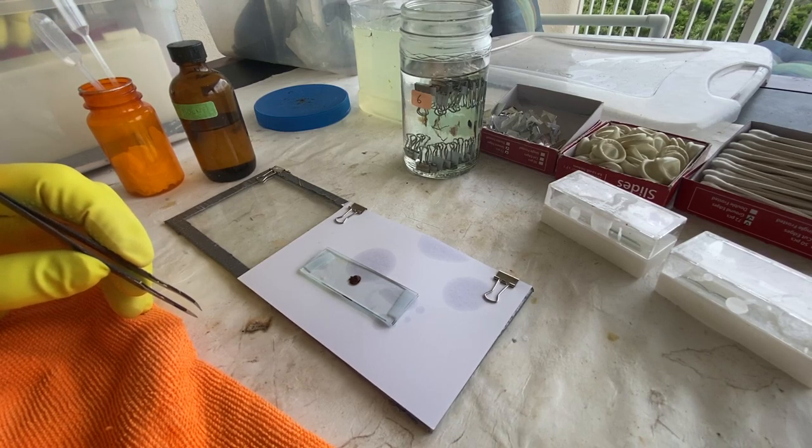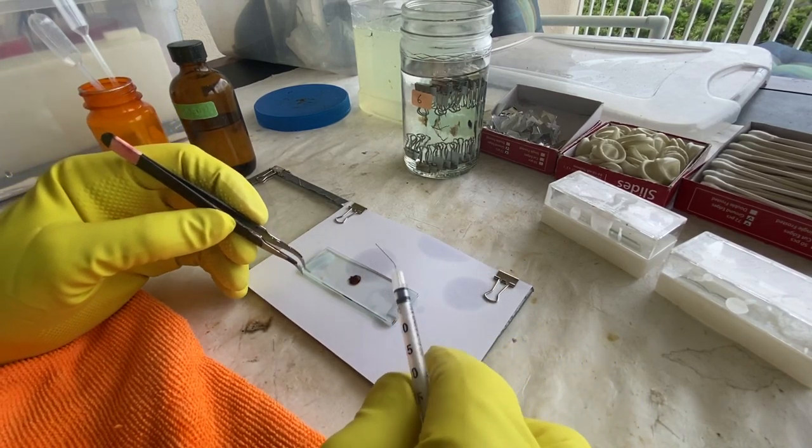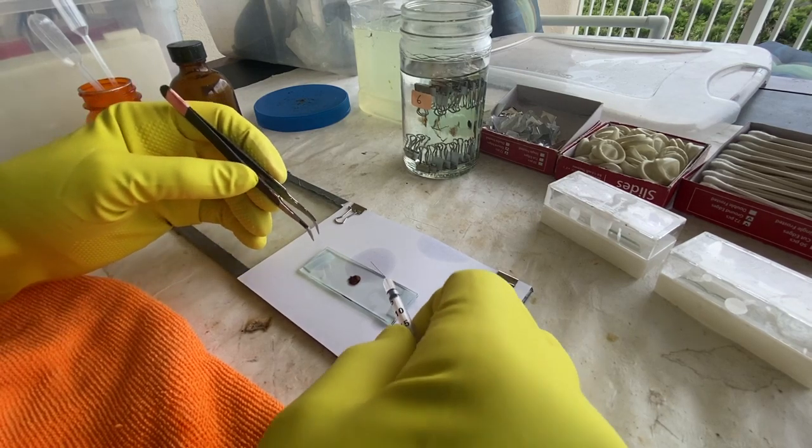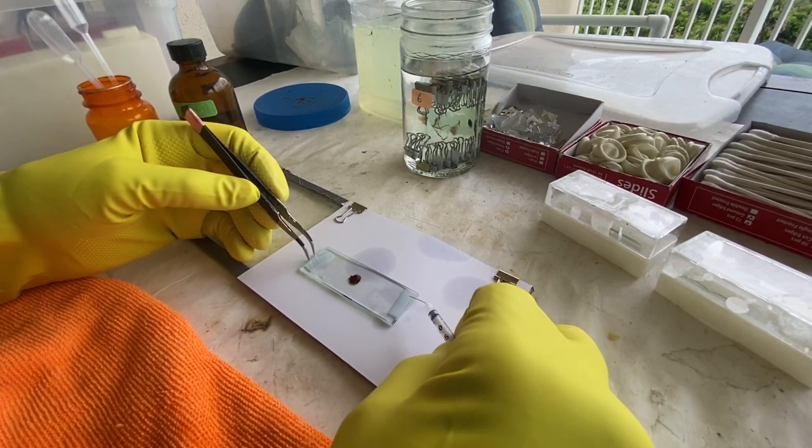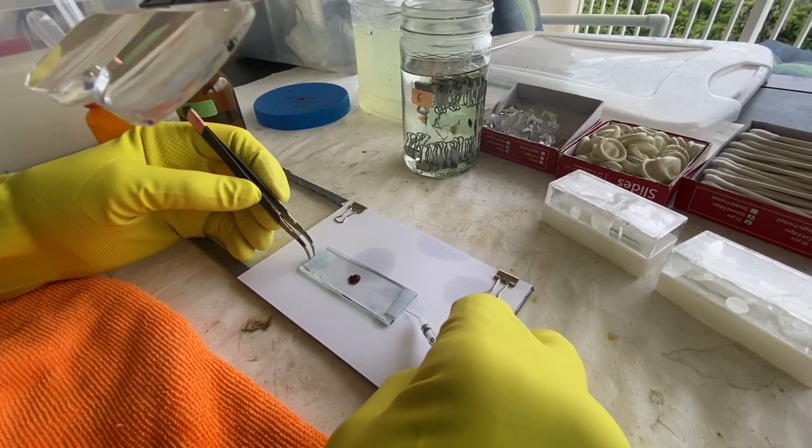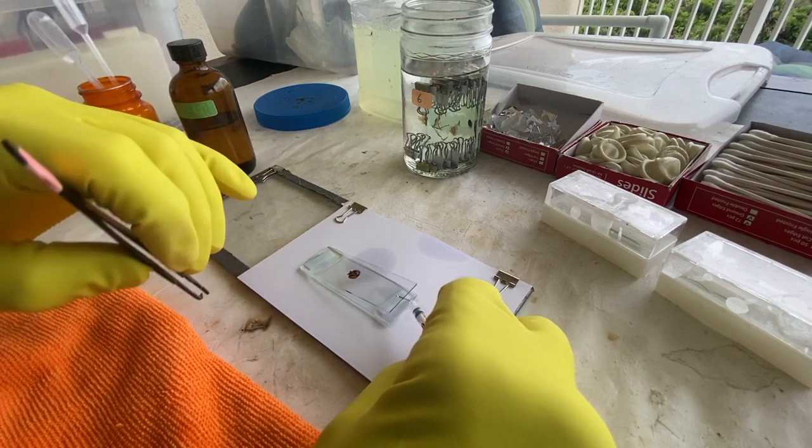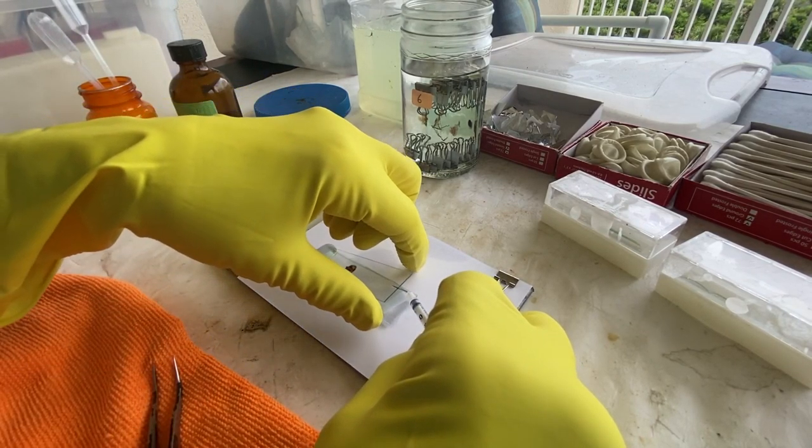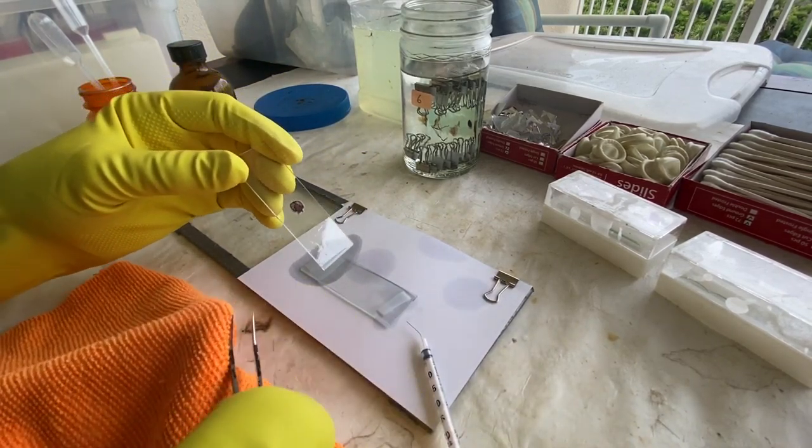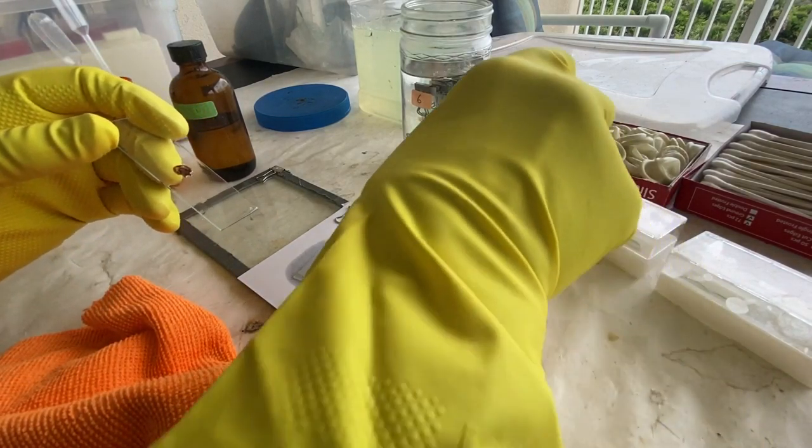Now we take the 30 gauge syringe needle. What we're going to do is we are going to pry it between the two pieces of glass and we're going to lift up the glass slide. It will stick to one or the other. Here we are, it's stuck on the top half this time. That's okay, I don't care.